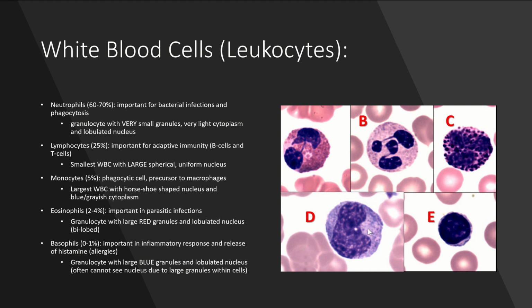I don't want to get into too much detail about this because it's a lot of immunology if I get into too much detail. We mainly just want to know the big role: phagocytosis, precursor to macrophages, and then how to identify them.